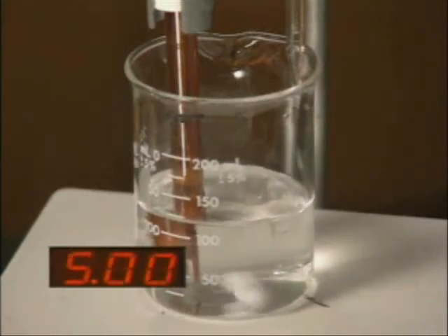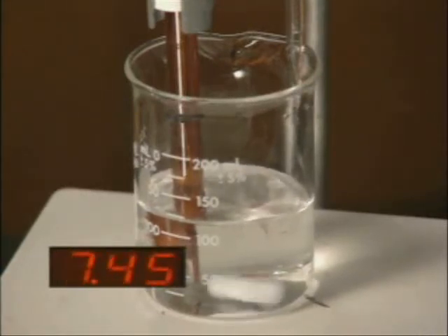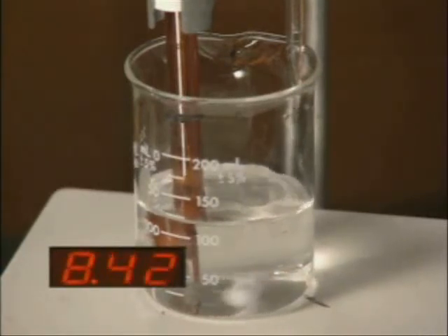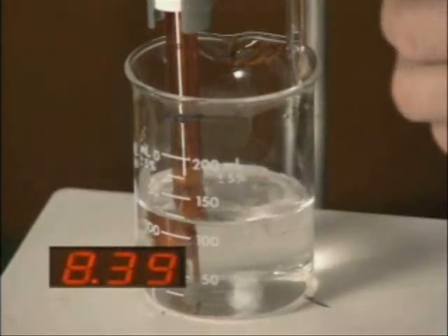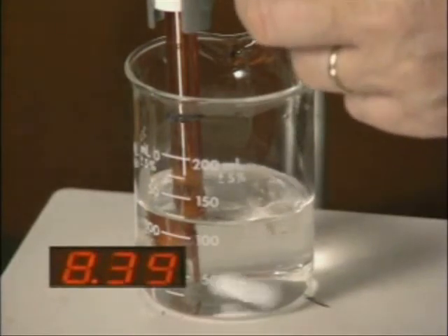Suddenly, the pH changes rapidly as the endpoint passes. The solution quickly becomes very basic and again the pH changes very little.